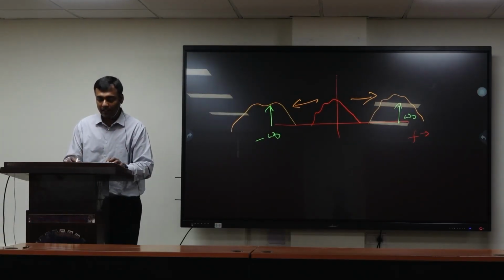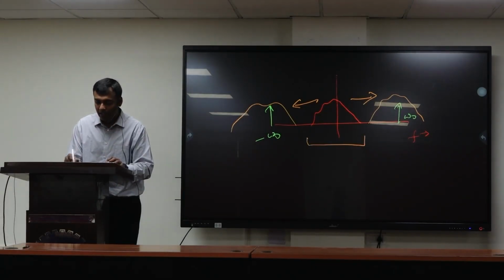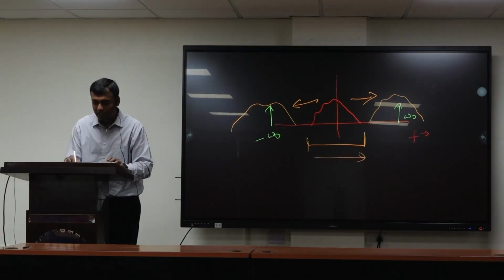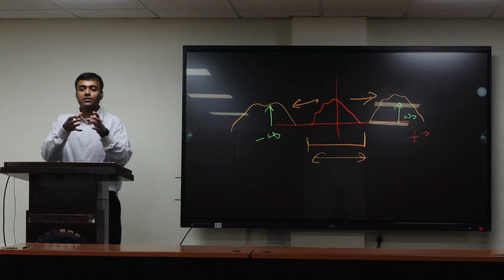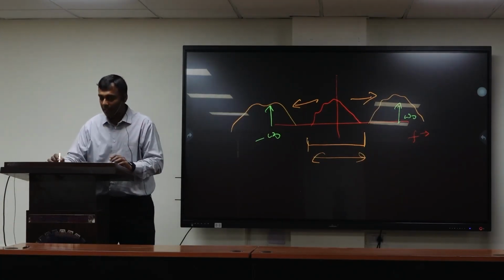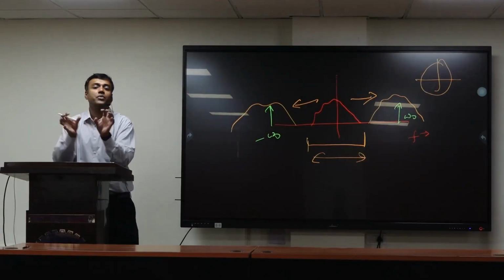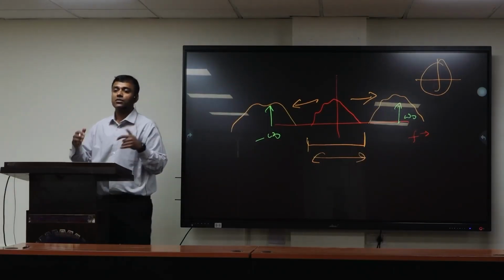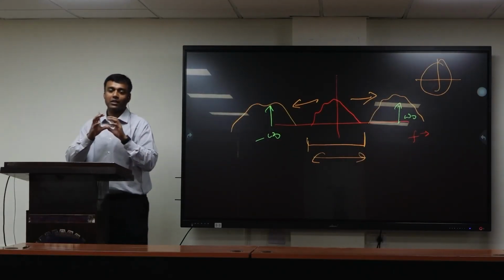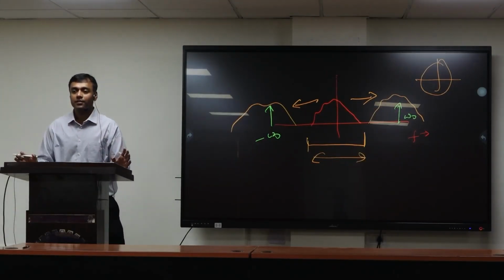Imagine taking an object which has a range of frequencies, and you shift it here. The diffraction limit is equivalent to you only having access to some small range of low frequencies. There is a diffraction limit spatially, and in the frequency domain it means there is a ring of spatial frequencies. It's a low pass filter in the frequency domain. The process of light propagation is doing a low pass filtering to your light.